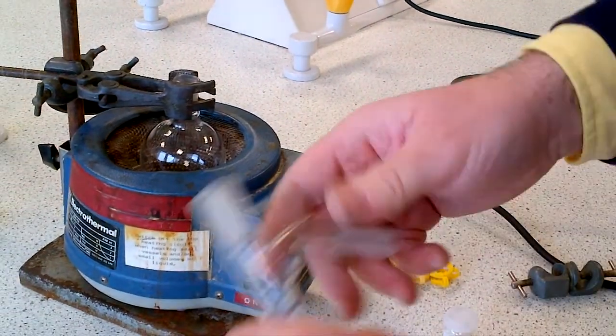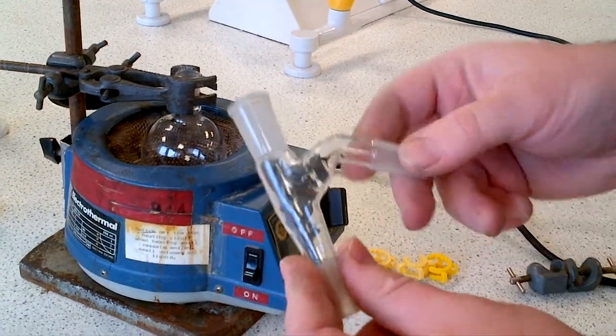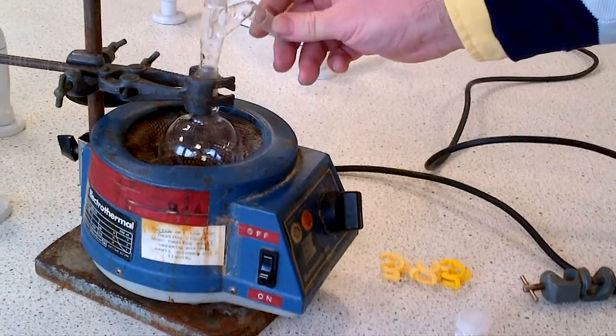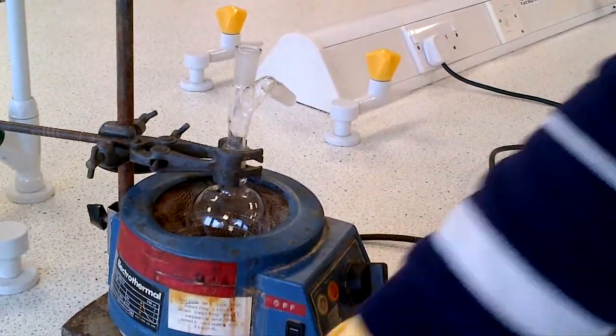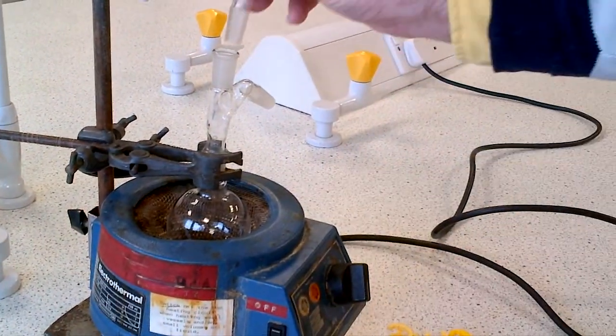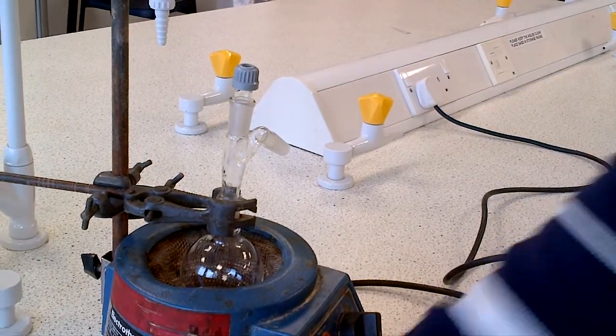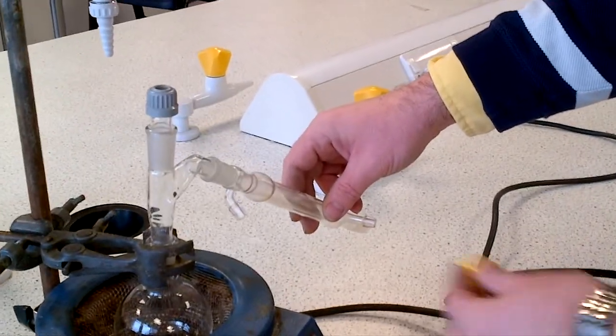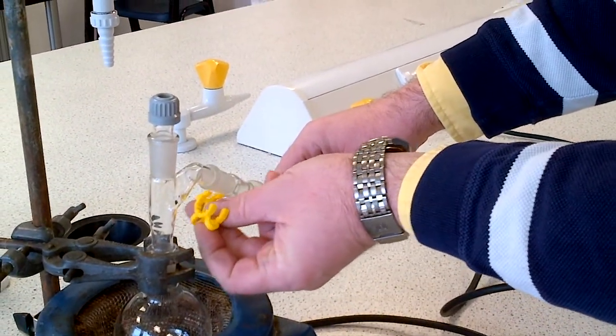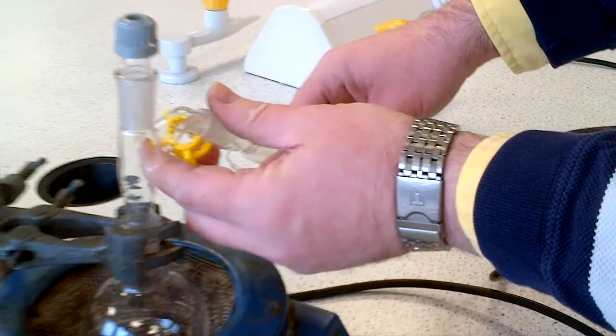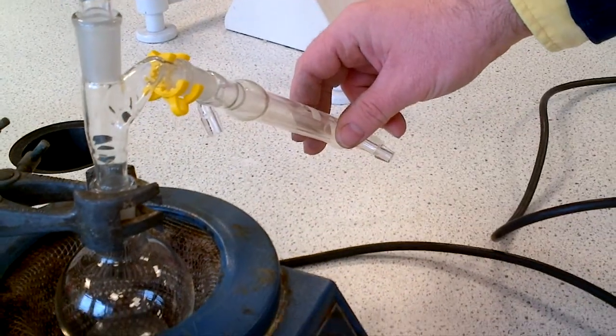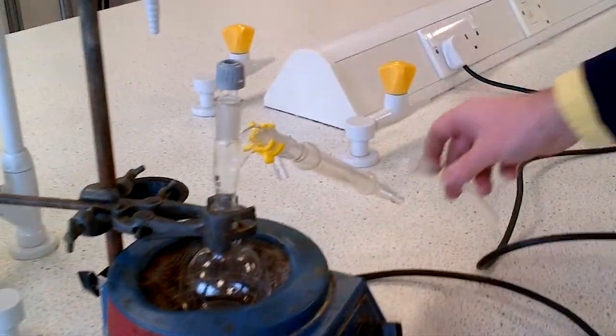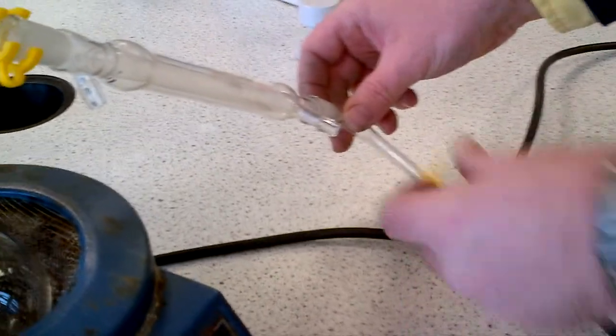Make sure everything is clean and there are no cracks on the joints, then thread in the still head. Put that in position. Now you clip on the condenser with one of these keck clips.